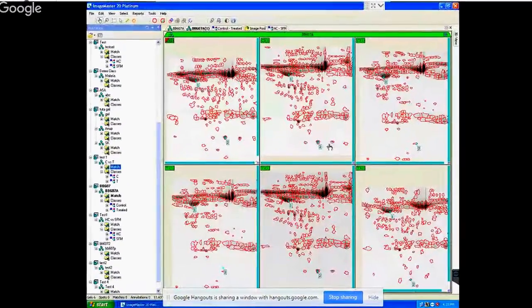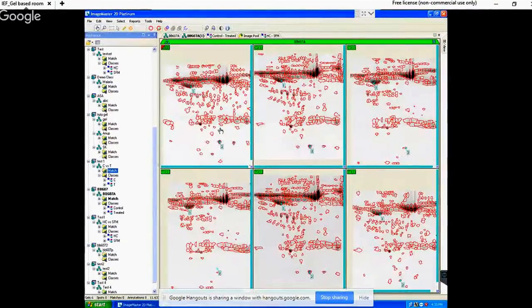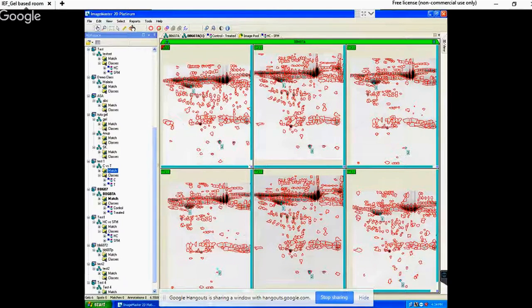Here you can see the uploaded results. There are C1, C2, and C3 — these are the control gels — and these are the treatment gels. These are the spots outlined by the software. Here you can compare different gels and check intensity differences. If you want to see how a spot looks in 3D, you can click on a specific spot and view its 3D profile.